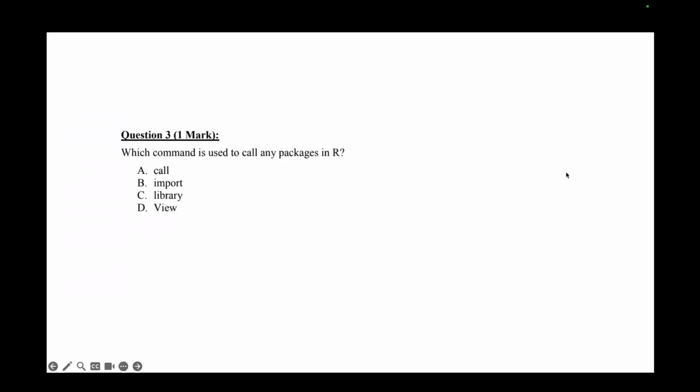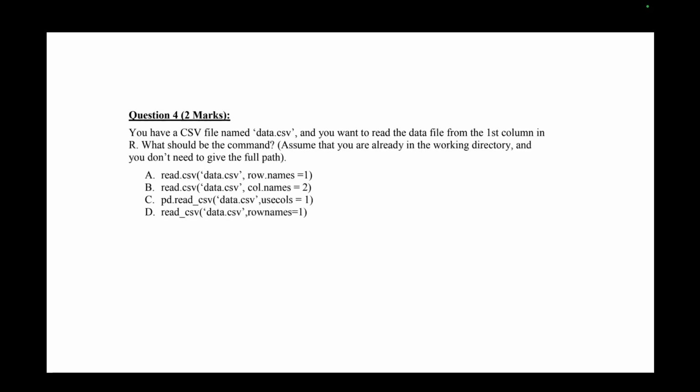Yeah, the correct answer is library. So use library in the brackets to give the name of the package. It calls the package.